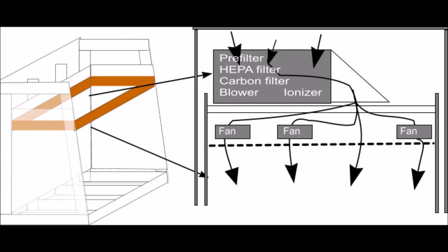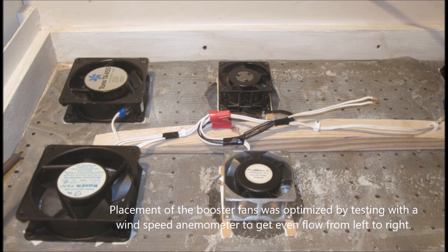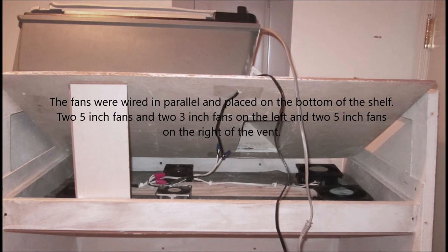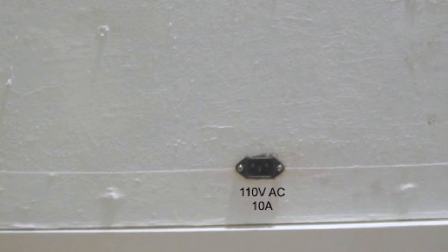I decided to add a booster fan layer on the bottom. These were extra fans I had lying around — all 110-volt AC. I played around with fan placement to get even airflow, using an airspeed sensor and CFM meter to figure out the optimal arrangement. Once I figured that out, the fans were attached. You can see the airflow path from the vent onto the fan unit — the bottom view shows five-inch, three-inch, and five-inch fans.